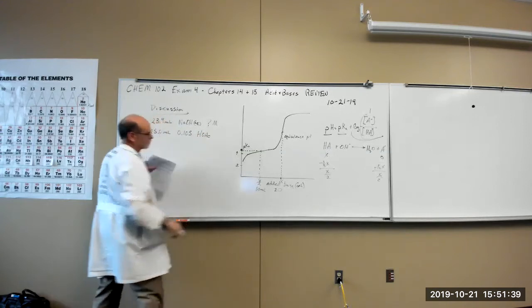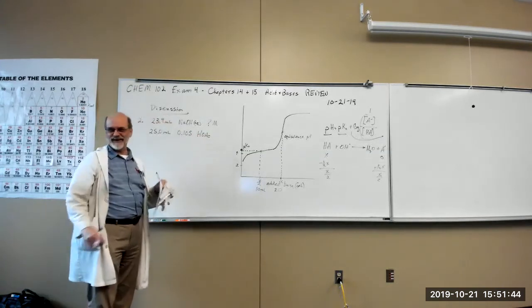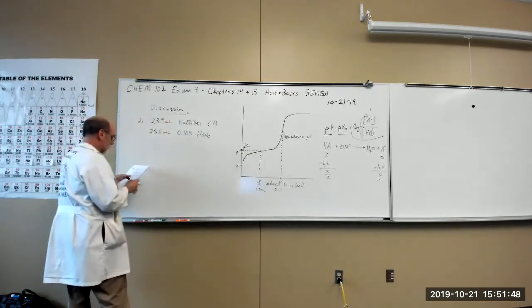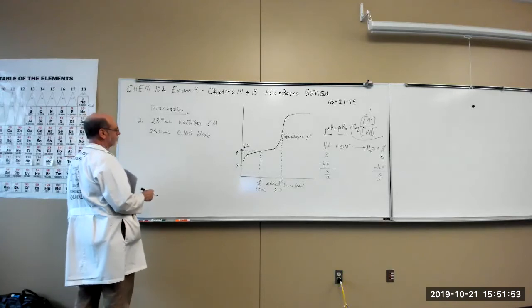That's my abbreviation for acetic acid. Then the question is, what's the concentration of your sodium hydroxide?